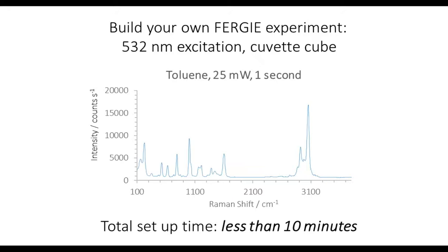Okay, so that's it. I've got on the slide here, total setup time less than 10 minutes. That whole procedure took me 5 minutes. I've had a little bit of practice, but we're talking about minutes in terms of total setup time, and that's switching right from, if you think back to the start of the video, when I had the fiber coupled in there. So that's the setup time.